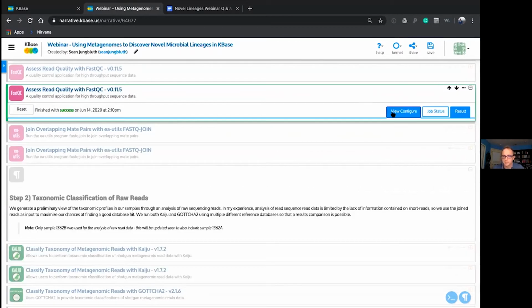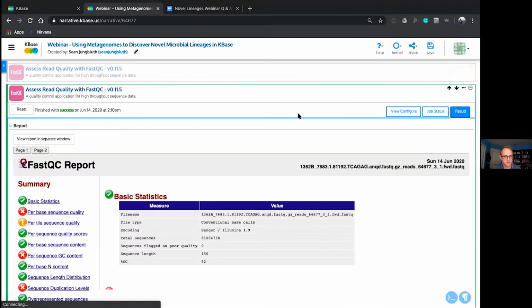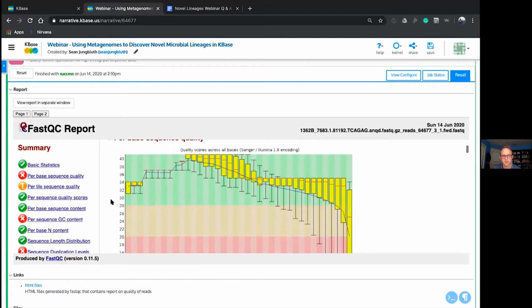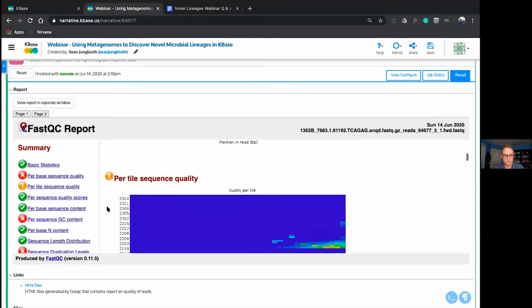And expanding the second box here, this is just the second sample, the sample from location B, which we ran identically to how we ran sample A. And just taking a quick peek at the results here, we see, I would say, mainly a good quality profile. It seems like it tails off a little bit more in the B library here. The last base, the average, is in the yellow zone. So perhaps more trimming can be performed there, but we're not going to scrutinize that today.